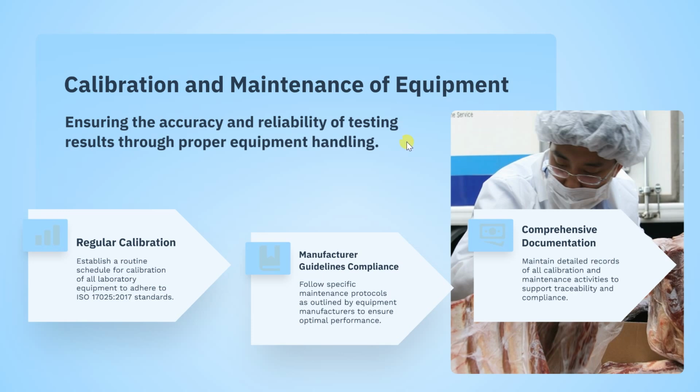Now, as managers, you need to make sure that calibration and maintenance of equipment is well conducted on a regular basis, and the one who is in charge should be held accountable if equipment is left for a long period of time without maintenance. This ensures the accuracy and reliability of the testing results through proper equipment handling. We've said that someone handling this equipment should be highly qualified and trained on a regular basis, and the equipment also maintained and calibrated on a regular basis.